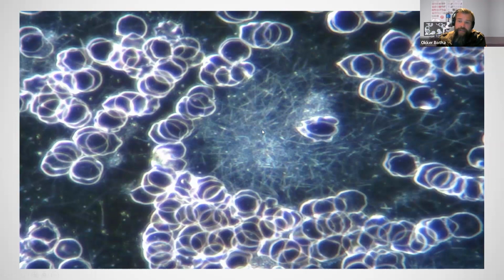These lines on the screen are something quite common. We see this on a very regular basis in clients. It's related to liver stress, and also to an increased risk of coagulation. So people that are prone to blood clots and so on, poor circulation. But often the underlying issue we need to address with this is the liver, so liver and digestion. It's very important to be able to see these, and they are actually quite faint.